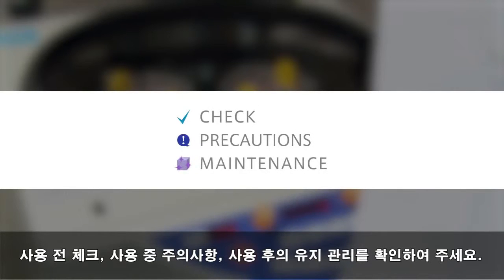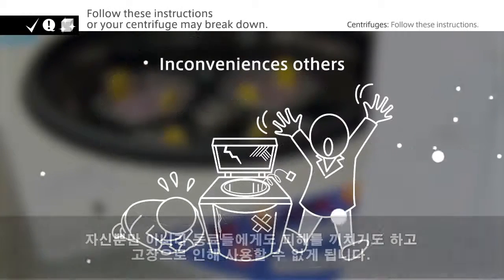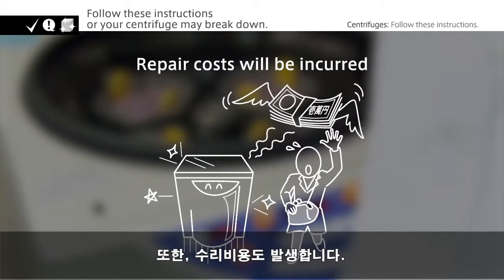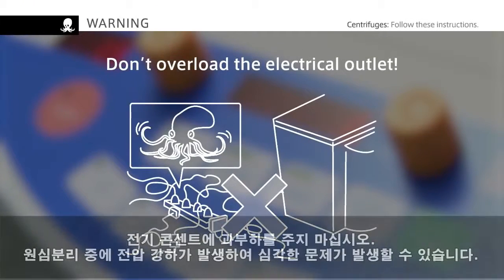To summarize: check before use, take precautions during use, and perform maintenance after use. If you don't follow these instructions, your centrifuge may break down — this will inconvenience others if the centrifuge is being shared, and a broken centrifuge means you won't be able to use it when you need it, and repair costs will be incurred. Finally, a warning about installing your centrifuge: don't overload the electrical outlet, as this could cause a voltage drop during centrifugation, leading to serious trouble.